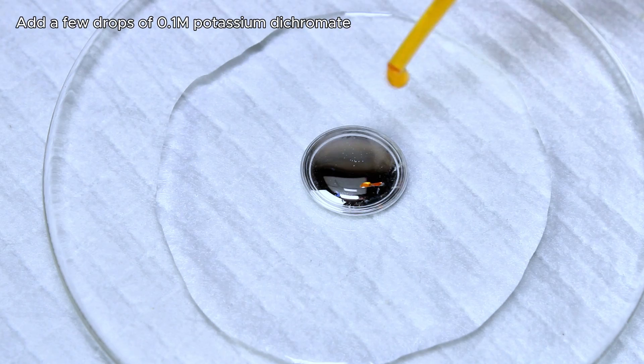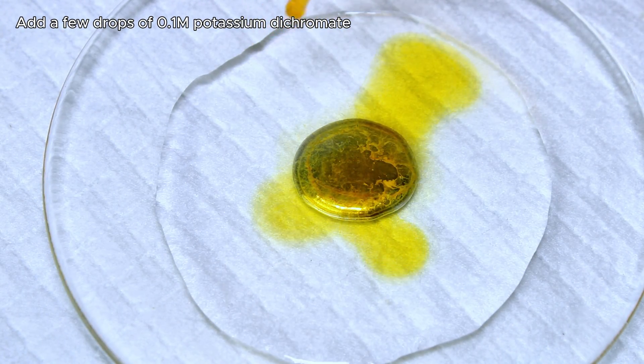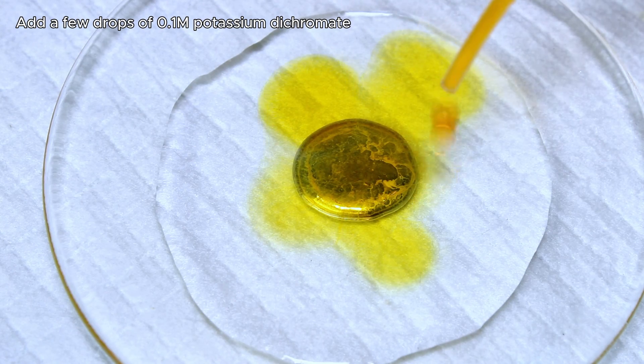Now I simply add a few drops of a 0.1 molar potassium dichromate solution, which immediately forms a thin, rigid layer of mercury oxide around the blob.